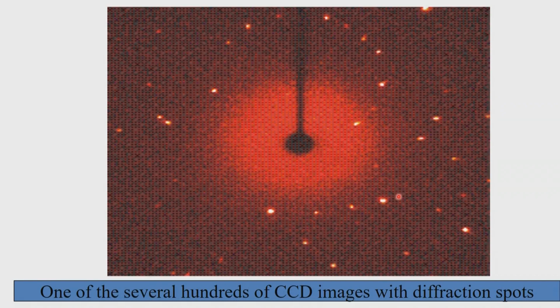There are other detectors which one can use. The detectors could be image plates, the detector could be a CMOS detector, which is essentially used in space technology, and CCD, which is very commonly used nowadays. Image plate is very commonly used in case of macromolecular structures because it is possible to wipe the image on the image plate before we re-expose. So, these are some of the advantages in an image plate where the reflections are very closely spaced. Those materials which are not so very closely placed can be collected both on CCD as well as CMOS.